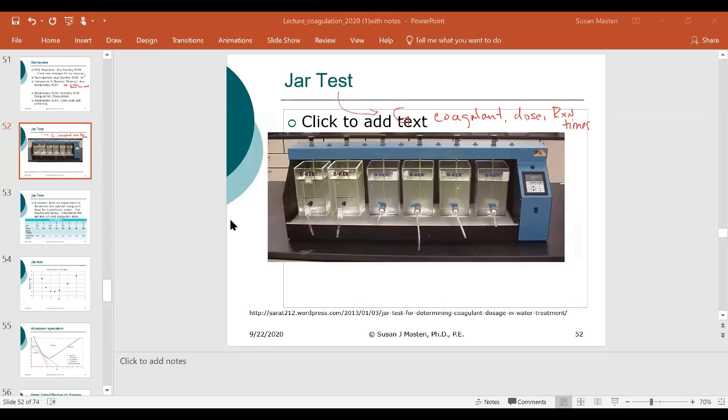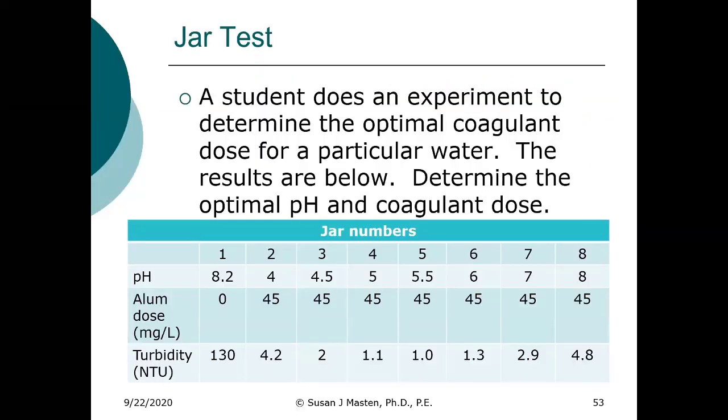So we're back here to the PowerPoint. So what I've done is I've actually gone through and I've just given you some examples in terms of methodology, how we would look. So for instance, in this case, we have 8 jars.